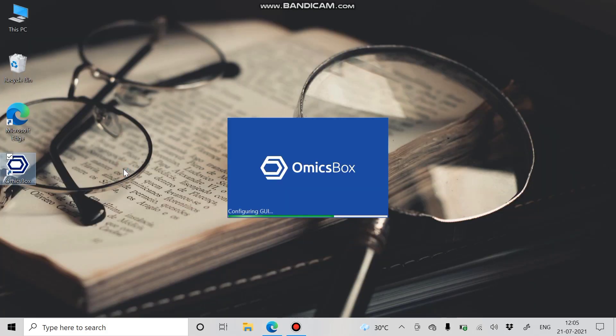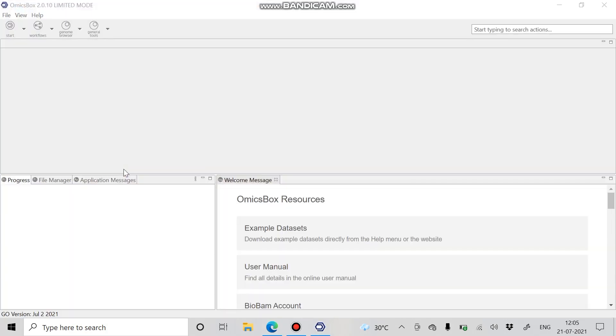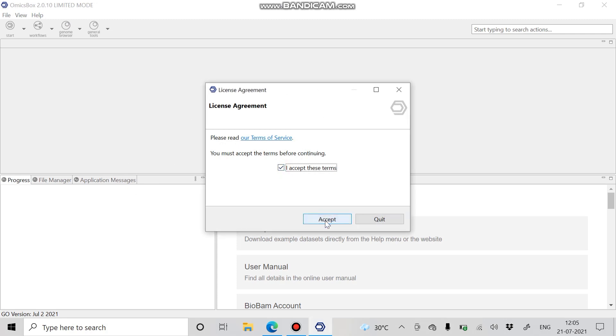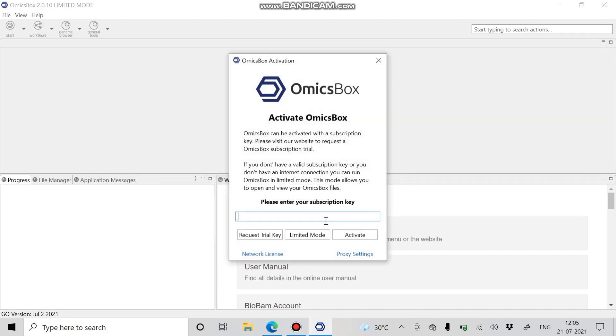Once the activation is done, the activation key will be given through email. When you open the OmicsBox wizard, a prompt window opens asking for the activation key. Just paste your activation key here.